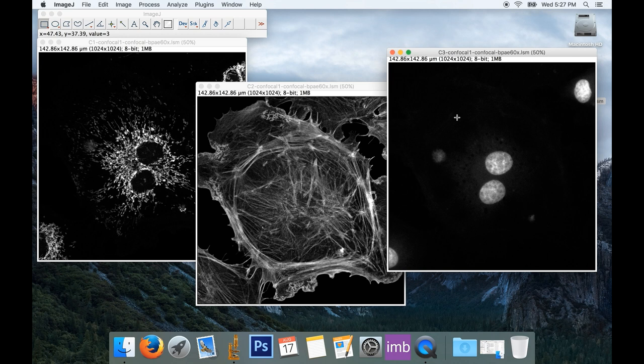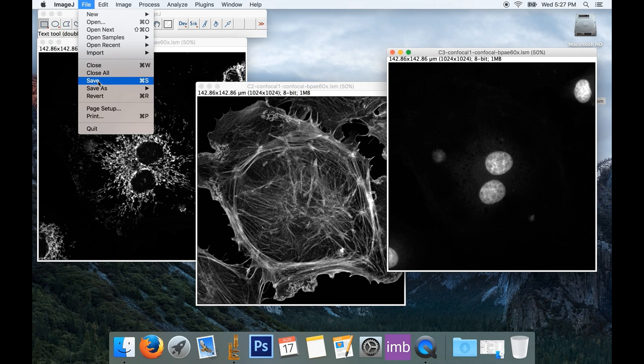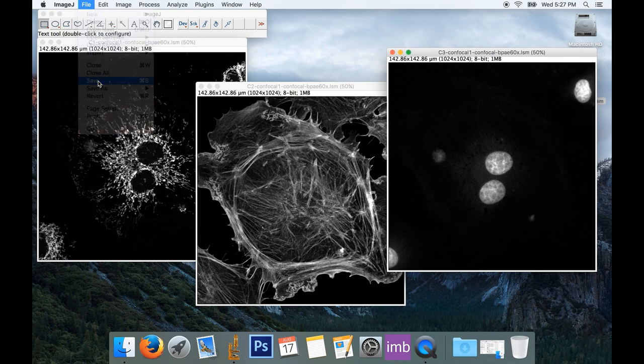If you do that in ImageJ, it'll apply a smoothing filter to your image. So to stay safe, I just generally go to File and select Save or Save As. Now Command-S will work. But again, I'm used to shortcuts in Photoshop, so we'll just go to Save.